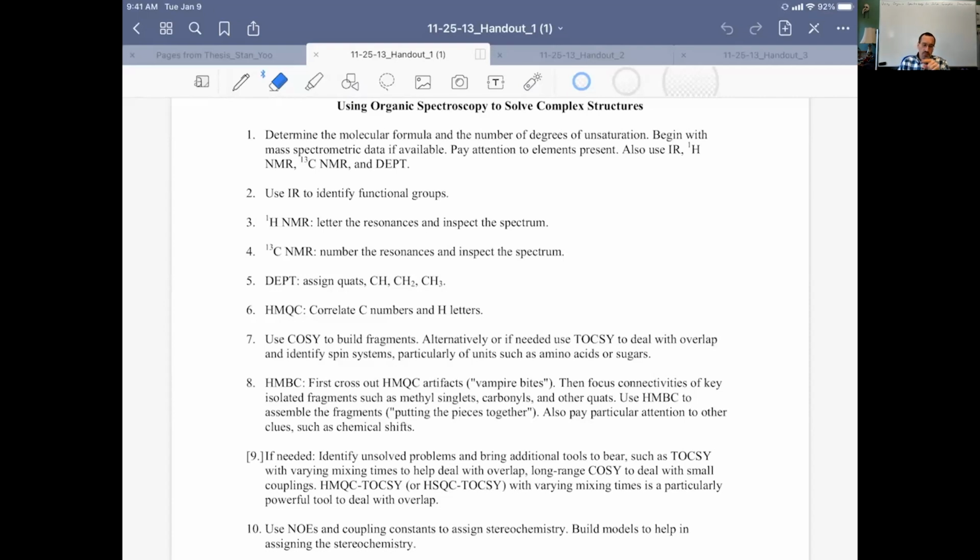One set of cross peaks off an isolated methyl buys you connectivity of 5 carbons, and another set of cross peaks off a different isolated methyl buys you at least 3 more. In other words, you're able to build up 7 or 8 of the 10 carbons without any other data. So the HMBC can be very powerful.